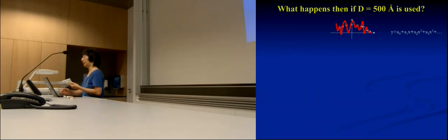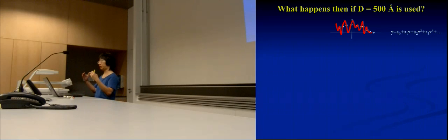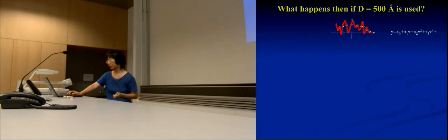And also, let's say I want to sample it here, away from where my data point is. It could be a value really high or really, really low. You're not using the power of fitting to create an averaging effect on your data. So if you fit too far, the data you're going to get, when you start sampling, becomes noisy, because you're not using all the neighboring data to create your sample point. That makes sense? So you don't want to make it too big.